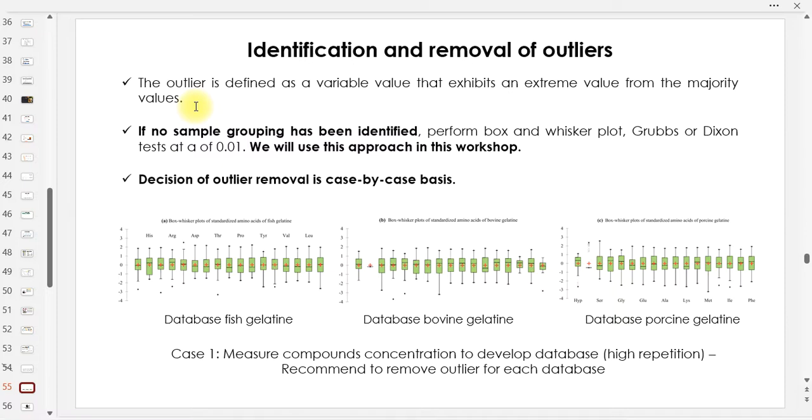From those individual results, if one falls far beyond the mean value, it can be considered an outlier. Usually we count an outlier as 2 SD or 3 SD away.